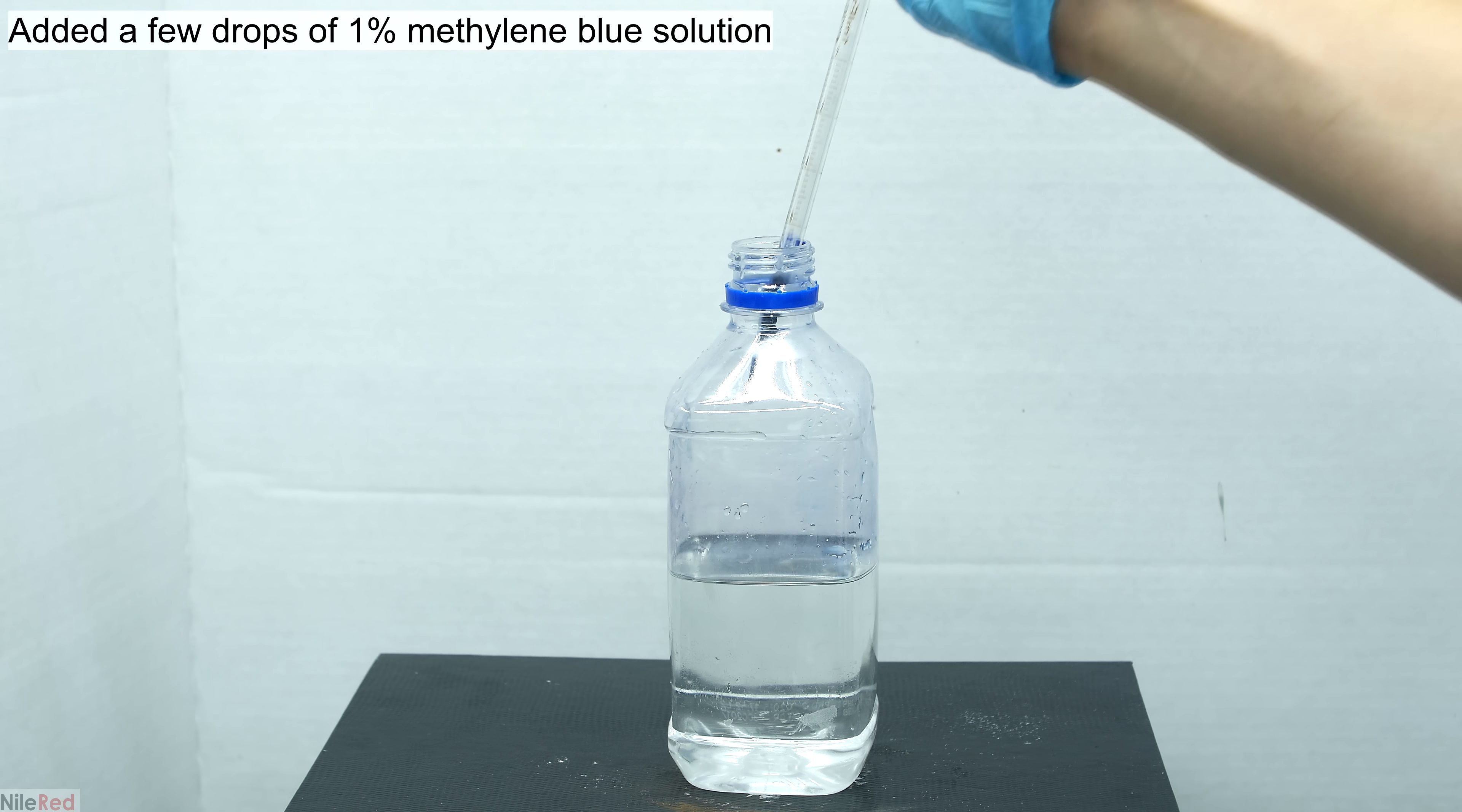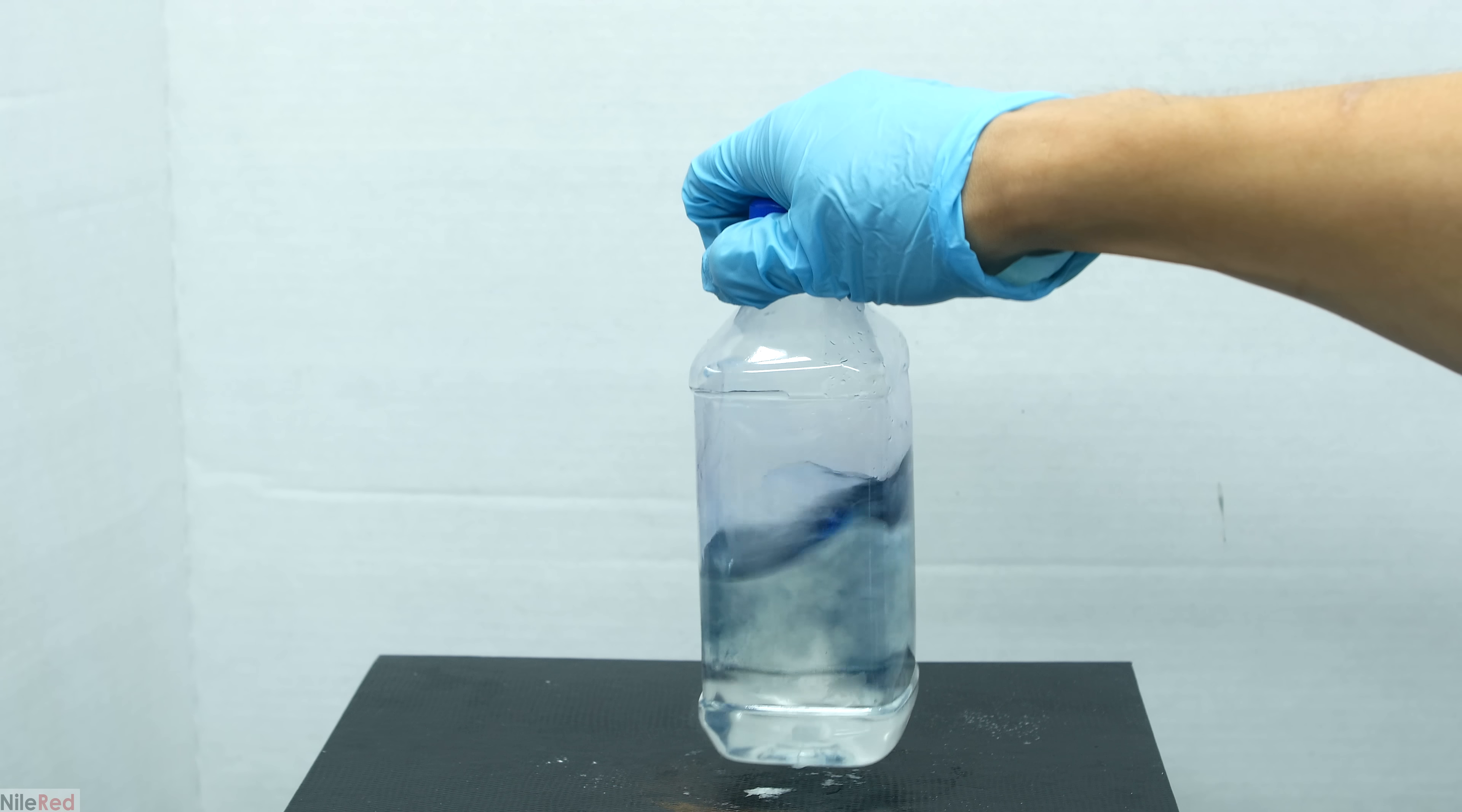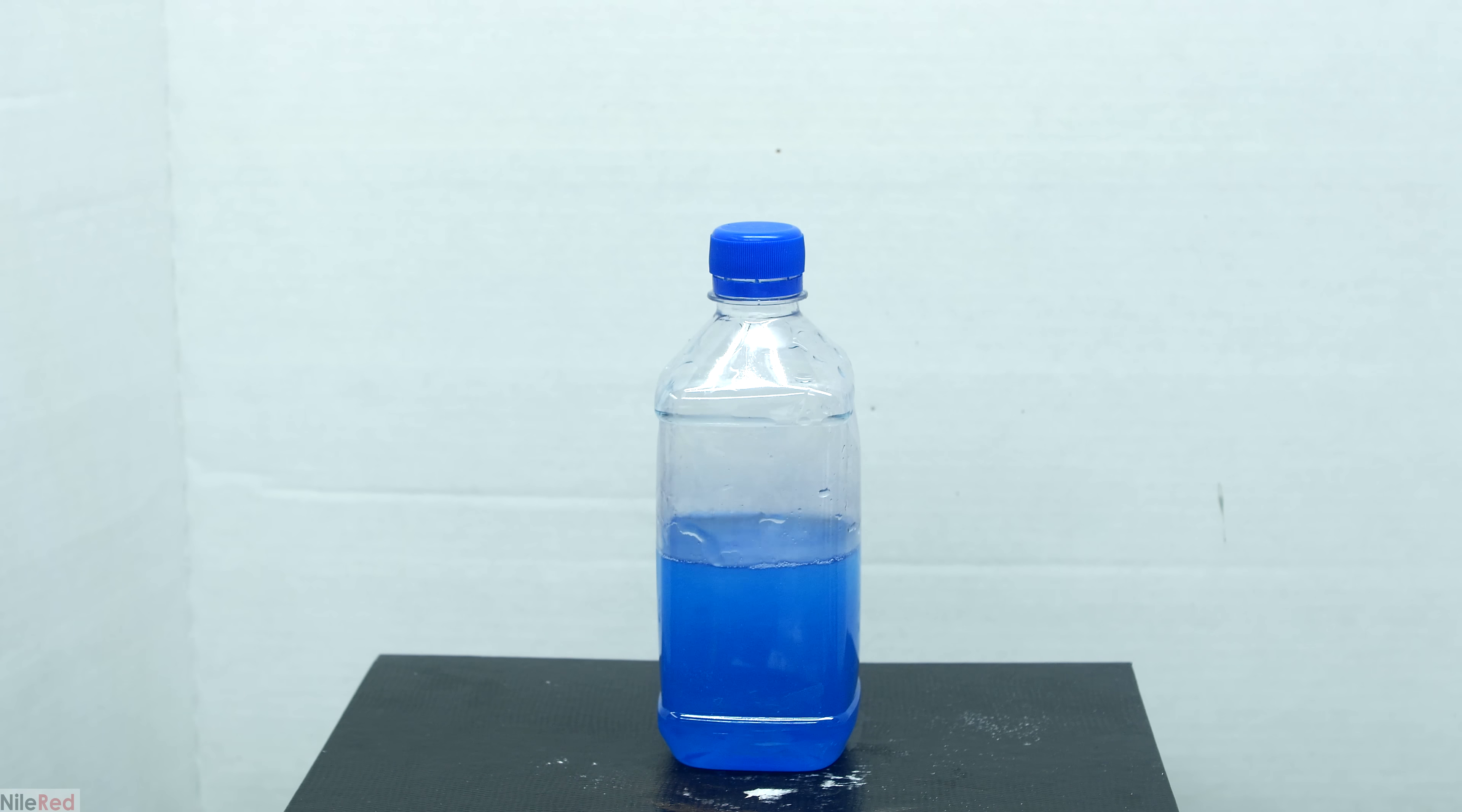The last thing that we need to do now is add a few drops of 1% methylene blue solution. I cap the bottle but before shaking it I swirl it a little and you can see the methylene blue disappear. However, when I go ahead and shake the bottle the blue color comes back.